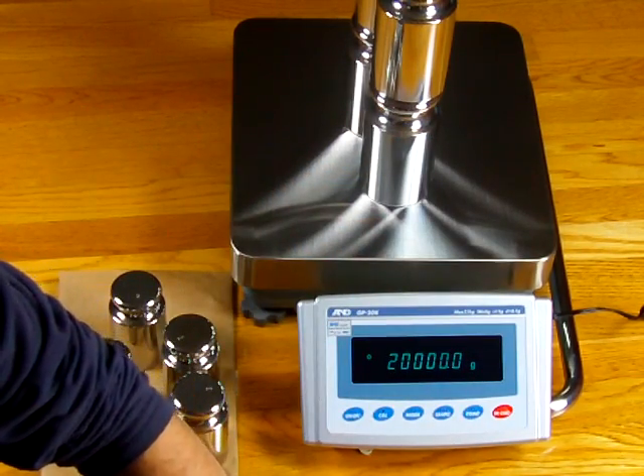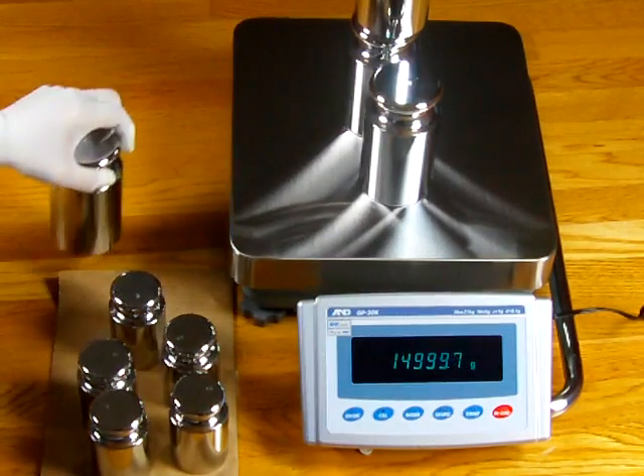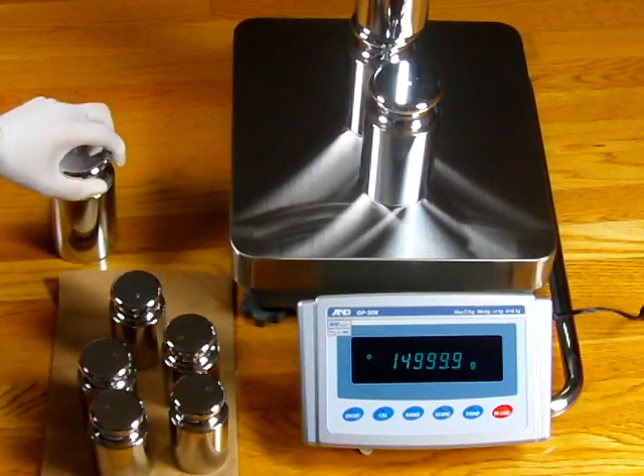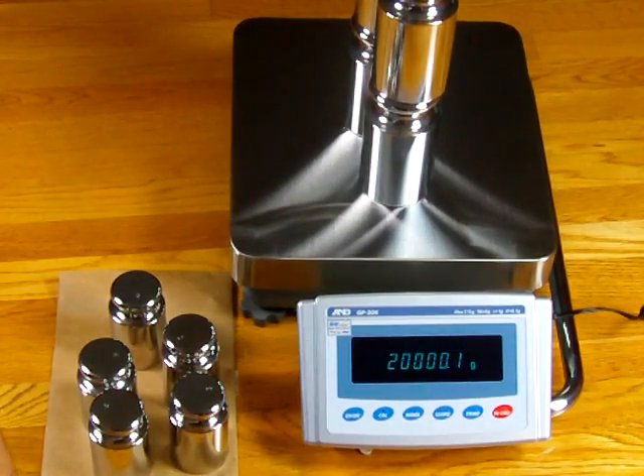What I want to show you in this video is that this particular balance has motorized internal calibration. You can see that with 20 kg, the balance is right on the money. The way I got the balance to be right on the money is I did an external calibration.